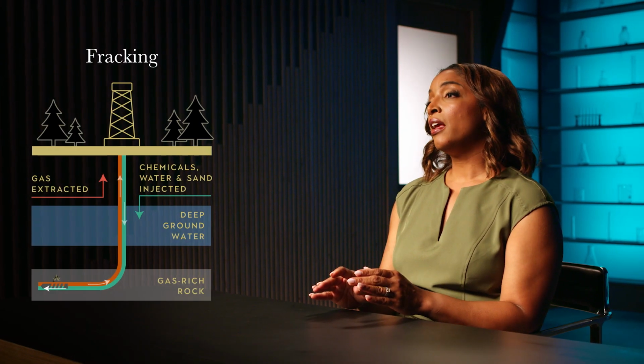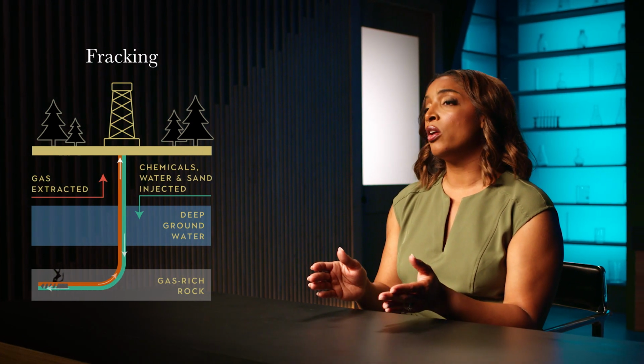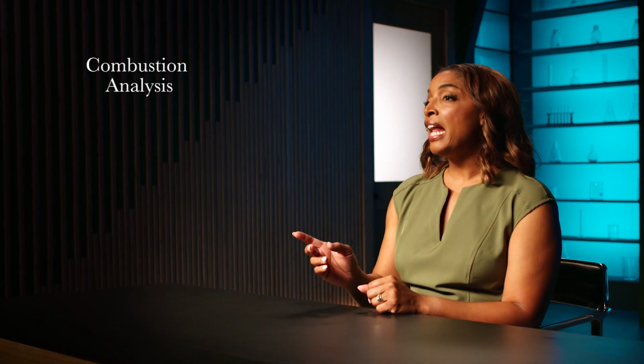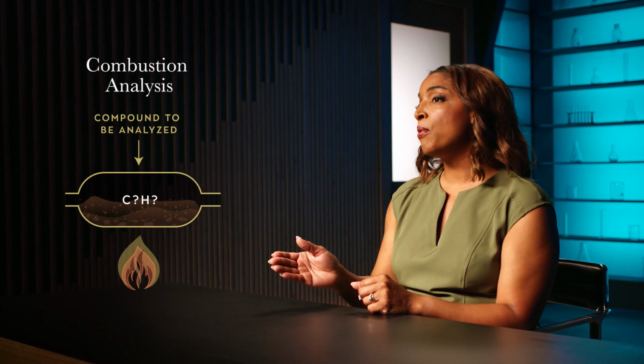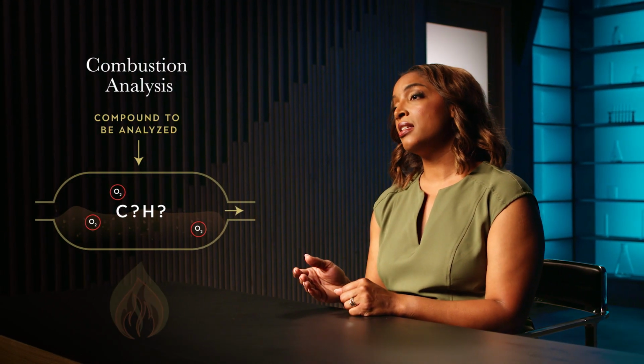During fracking, these compounds can be released into the soil and groundwater supply. BTEX compounds in the groundwater can be a problem because these compounds can harm humans. For example, benzene can cause cancer. Here's where combustion analysis can help us. Combustion analysis involves burning a sample with added oxygen and analyzing the resulting gases.